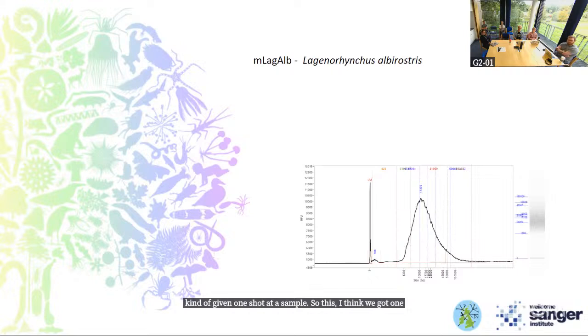one lung sample of the species that we had to try to separate out for DNA extraction, Hi-C, as well as RNA sequencing, and our extraction profile came out like this, which looks appropriate for what we term a direct submission. We have found that if our DNA falls within the ideal fragment size for a PacBio standard library, so between 12 and 20 kb, if we do a SPRI cleanup beforehand, we can generally submit that DNA straight for sequencing without having to do any DNA fragmentation on the sample.